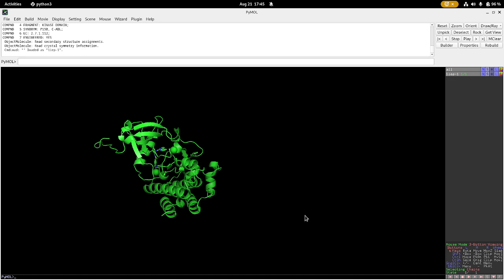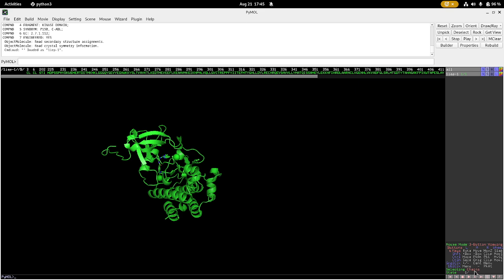All right, so next let's get these small molecule ligands that are inside of the chain that we want. I think the easiest way to do this is to click this S down here so it'll show this sequence up here. This is the amino acid sequence of the protein, but if you see at the very beginning here, it also has the ligands listed. So rather than trying to click them in three-dimensional space here, it's usually easier just to click them along this sequence.